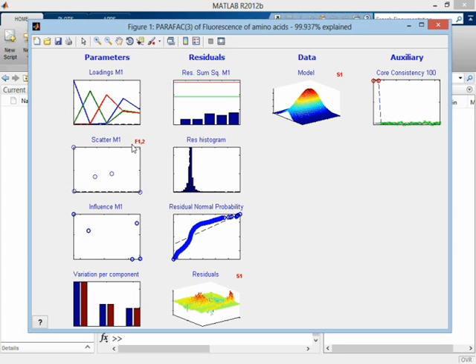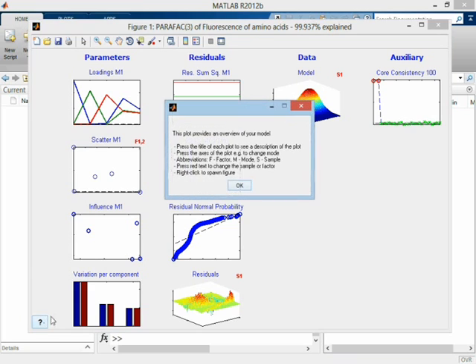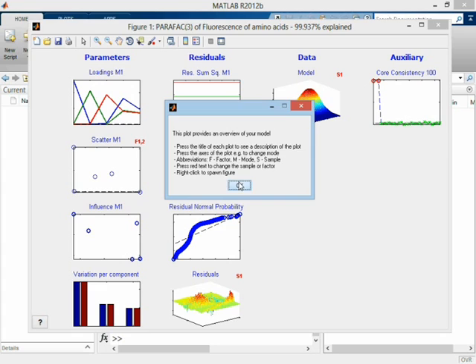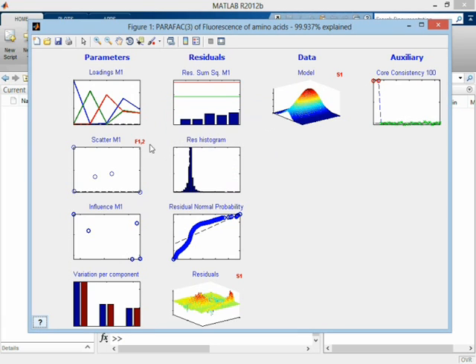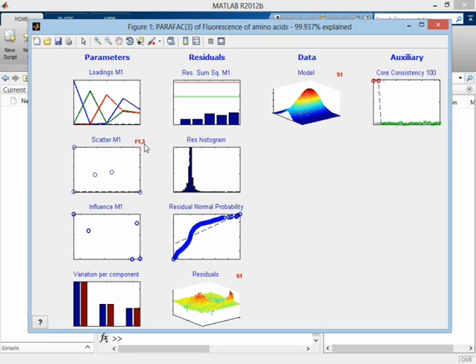If we get in doubt about the meaning of these things, we can just go down here, and there will be a short explanation of what the different things mean. F is factor, M is mode, etc. Now, I can change this by just clicking on the red one. Now, it's a score plot of component 1 versus 3, 2 versus 3, etc. So I can go through the different ones.